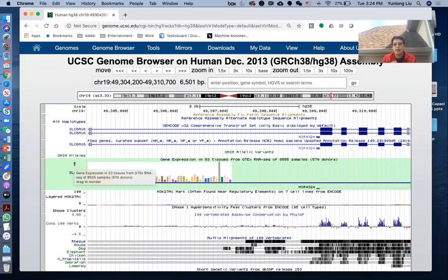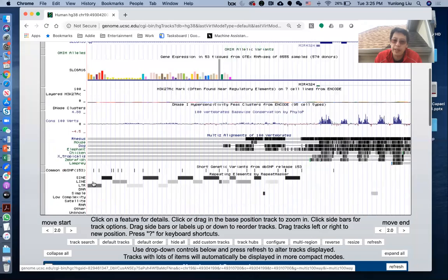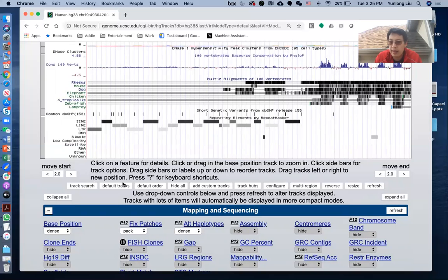When you visualize your data, you send a genomic coordinate you want to look at, and the Genome Browser is going to place that query and send a request to the HTTP server in our institution, bring that data back in, and show it on your computer. So the data itself is still on our own server, and only the link is sent to the UCSC Genome Browser server.